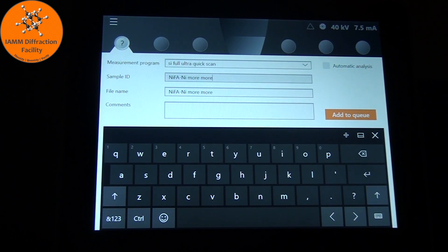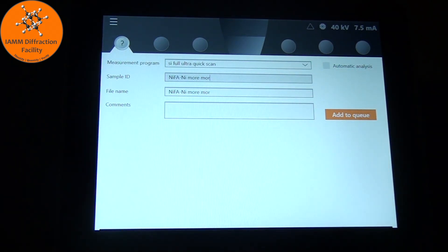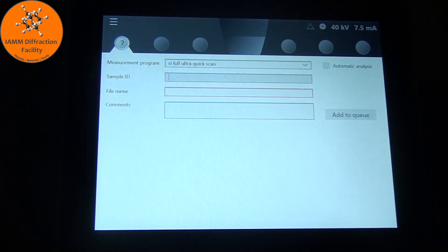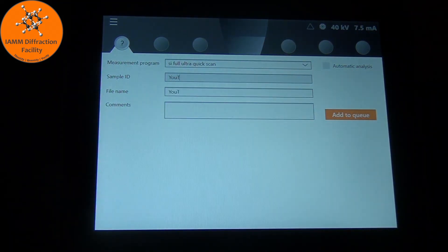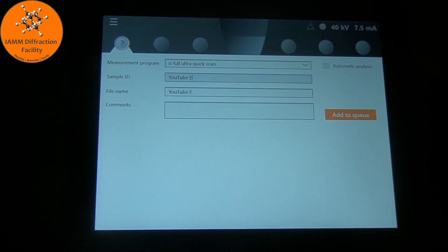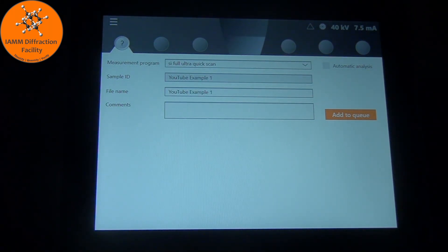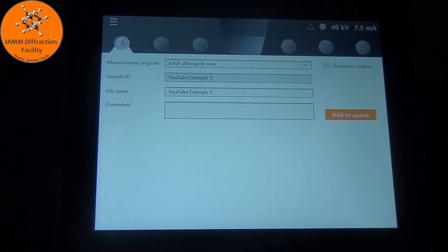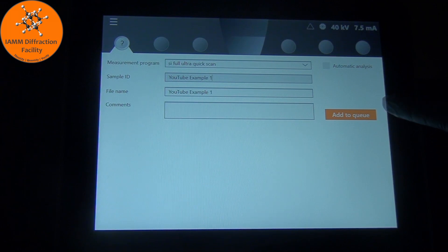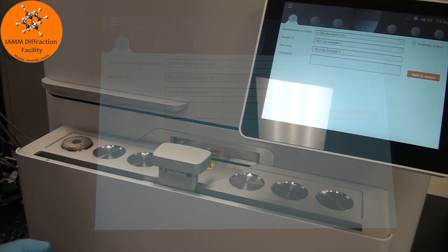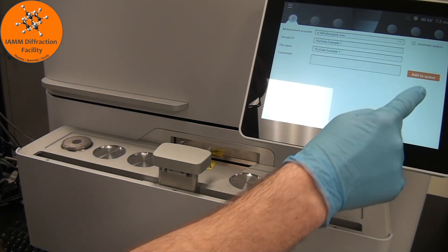I prefer to type on a physical keyboard, so I will name this YouTube Example 1. Once we do that, we can simply add to Q. So let's do that.